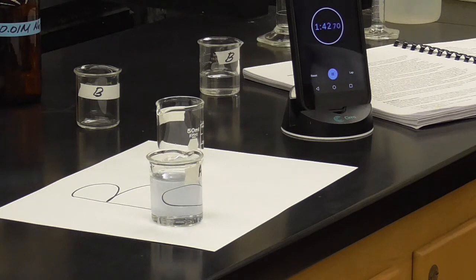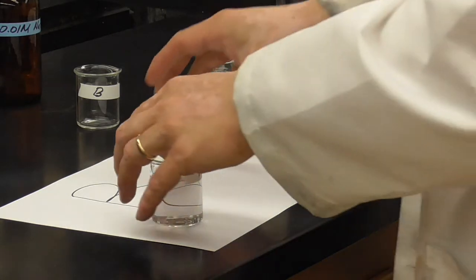And there it goes, just changed. Twice the concentration, definitely took much less time for that reaction to finish.